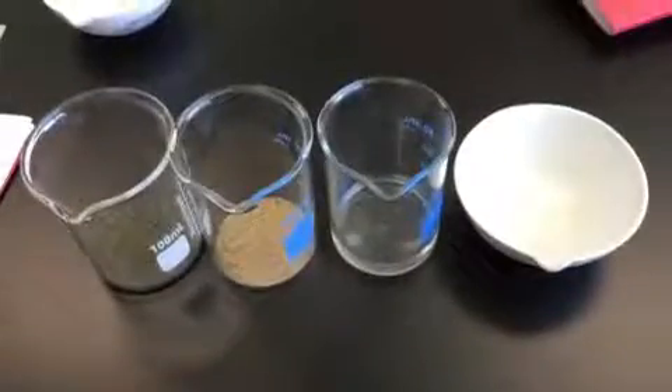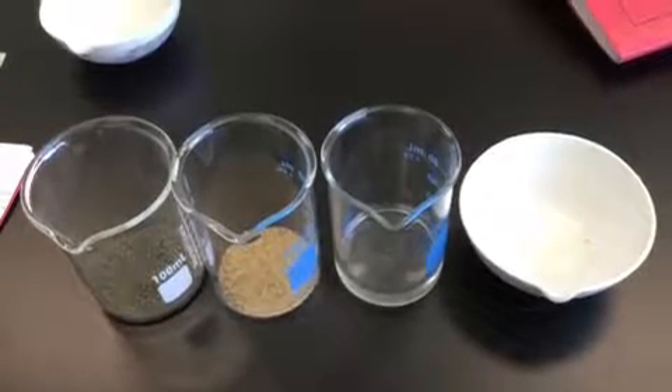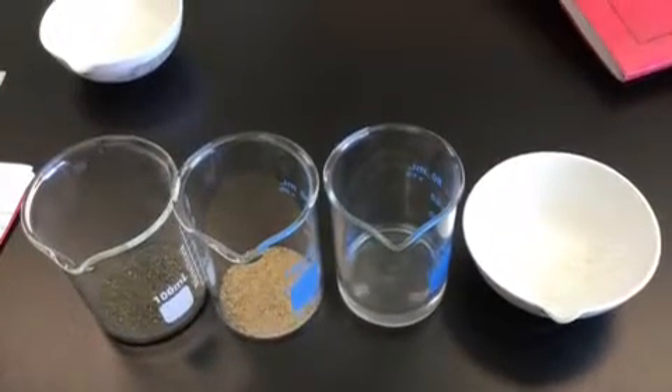This was our end result. We had separated the mixture into iron filings, sand, water and salt.